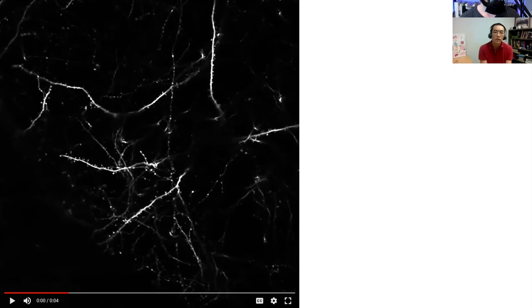Yeah. So this is also a remarkable image we're looking at. It's pretty much a black and white image, but the light spots are the insides of these branches of the neurons called dendrites that are lit up and they really do almost look like tree branches or something. Can you comment on some of the finer morphology here? So what I'm seeing is a series of line segments - those are the dendrites - but it looks like each of these dendrites has a bunch of little bumps or blobs sticking off of it. So what are we actually seeing there?